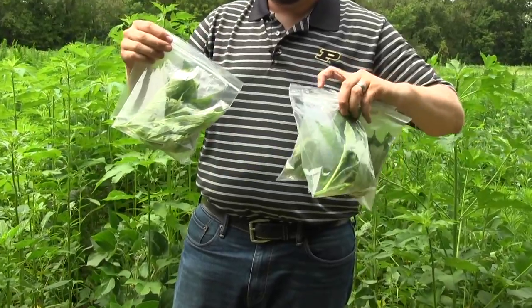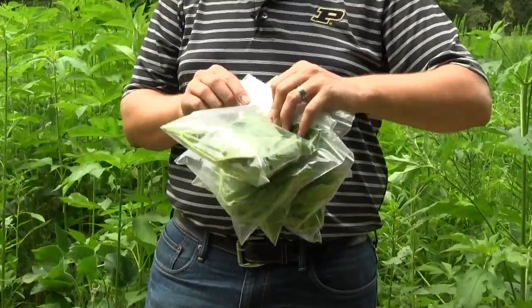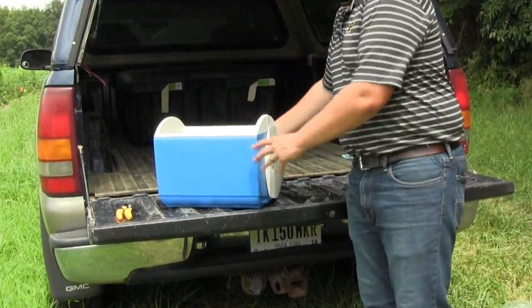Keep the samples in plastic baggies, as that retains the moisture within the plant sample. If you're not shipping them the same day or you'll be out in the field for a while, make sure to put those into a cooler with an ice pack to keep the samples fresh.